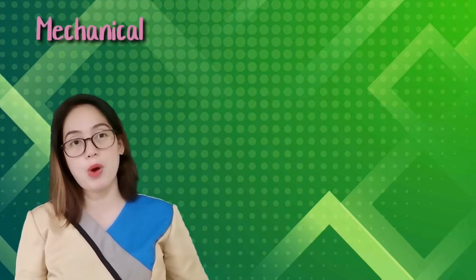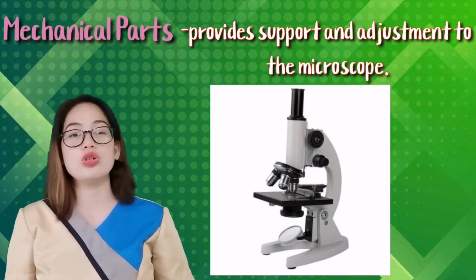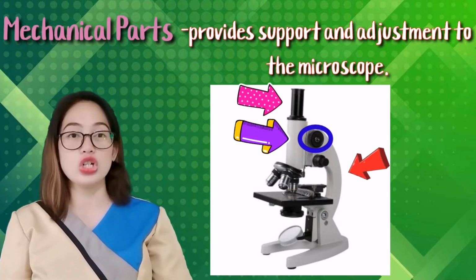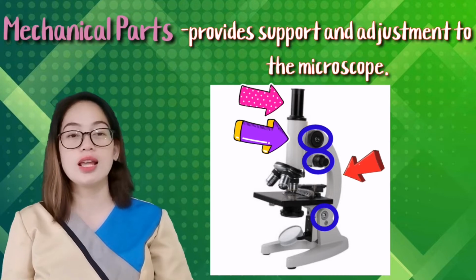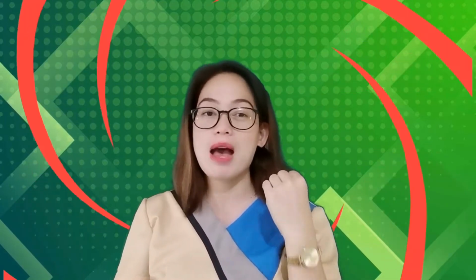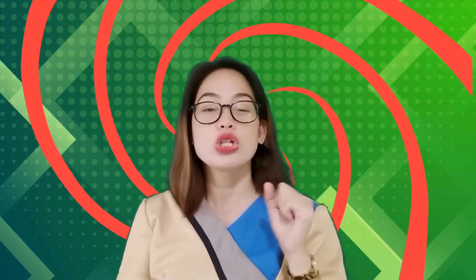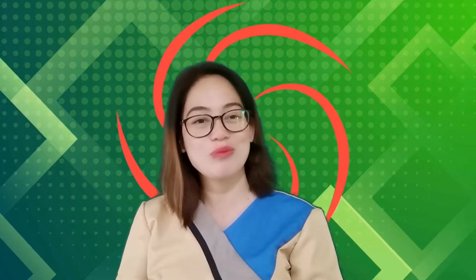And the mechanical parts provide support and adjustment to the microscope. This includes the arm, the body tube, the draw tube, the coarse adjustment knob, the fine adjustment knob, the inclination joint, and the base. Since we are already done categorizing the three major components of the compound microscope, the magnifying parts, the illuminating parts, and the mechanical parts, let's proceed to the specific functions of the parts of the microscope.